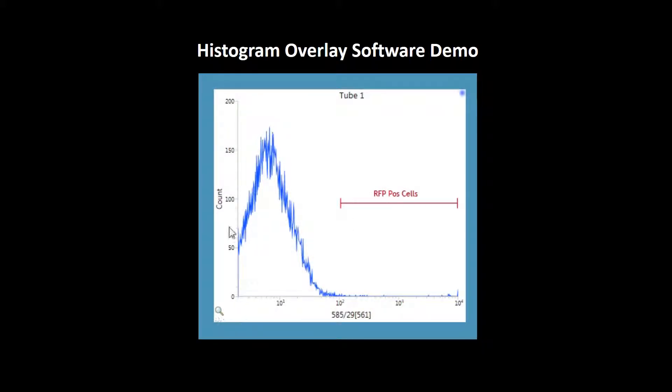This is my histogram plot for my unstained cells and I am checking for RFP positive cells. I want to show RFP positive cells in the same plot in histogram plot. In histogram you can show one parameter.